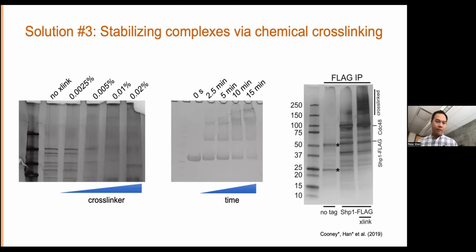So relatively low amounts when it comes to a structural biology standpoint, but we're able to determine some cool cryo-EM structures despite these low concentrations. And so yes, your cross-linking conditions will be dependent on the concentration of your prep. If you're working with some recombinantly purified protein, you've got several mgs per mil of the stuff, then sure, those cross-linking conditions will be different.